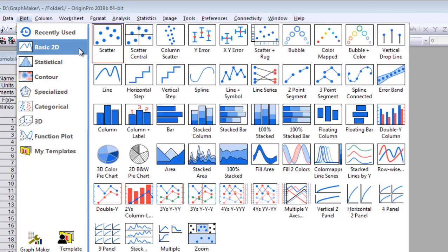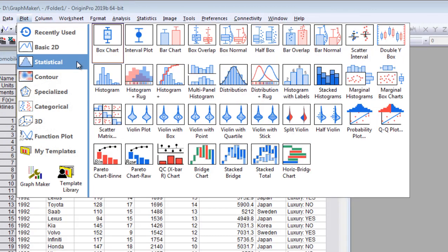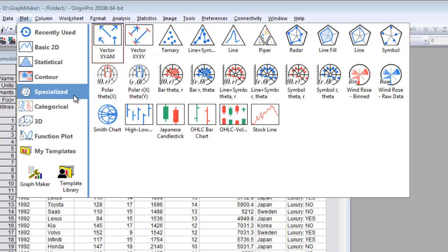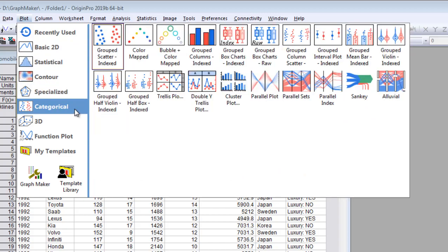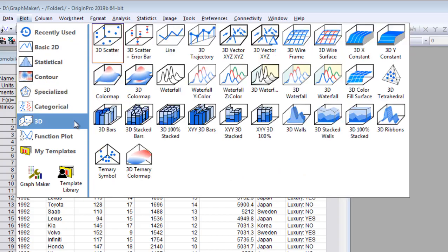Origin ships with over 150 graph templates for you to select from, arranged by category under the Plot menu.